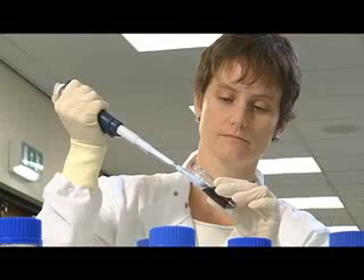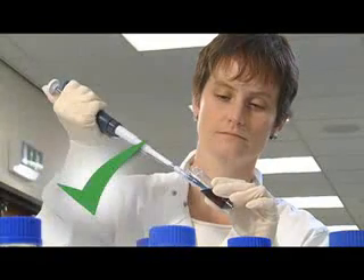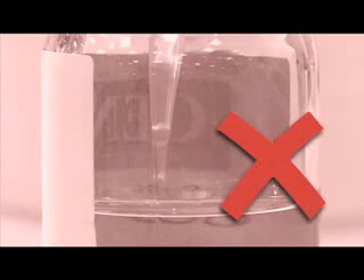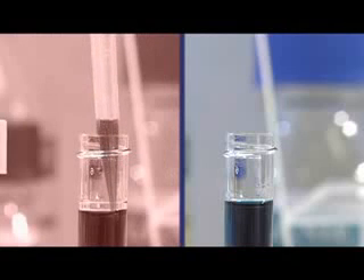Make sure you release the push button in a controlled manner. If you don't pause after you release the push button, there won't be enough time for the correct volume to be taken into the tip — air will be taken in instead. Also, when you're withdrawing a large volume from a narrow container, make sure the tip stays below the surface.